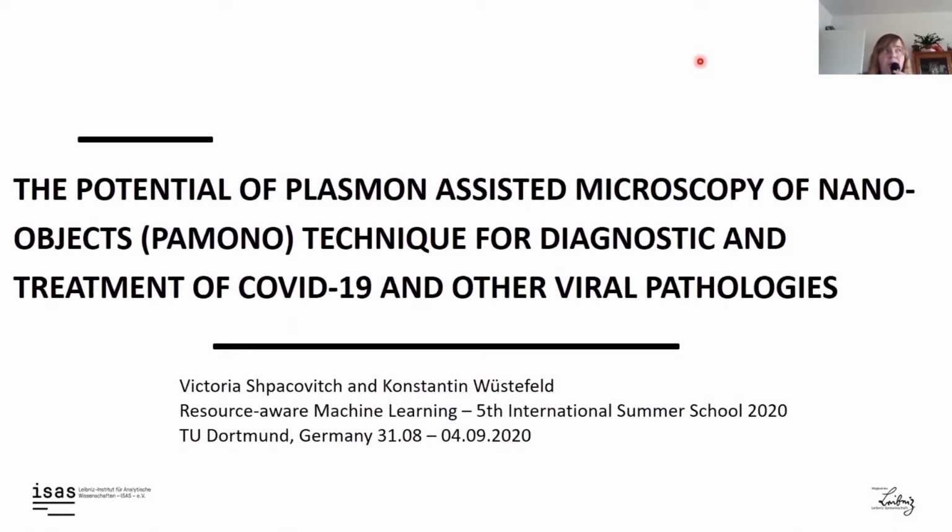And the first part of this lecture will be devoted to details about the PAMONO-sensor instrument itself. And in the second part of this lecture, Konstantin will discuss questions associated with software development for the PAMONO-sensor.